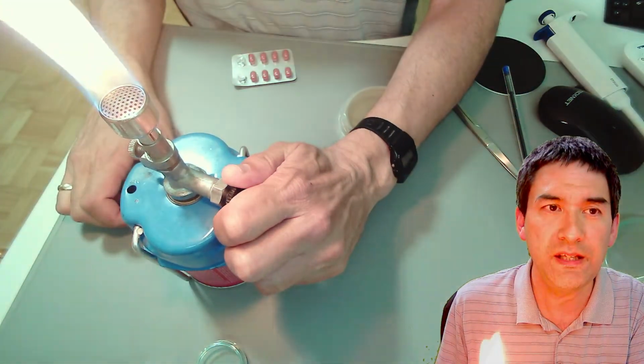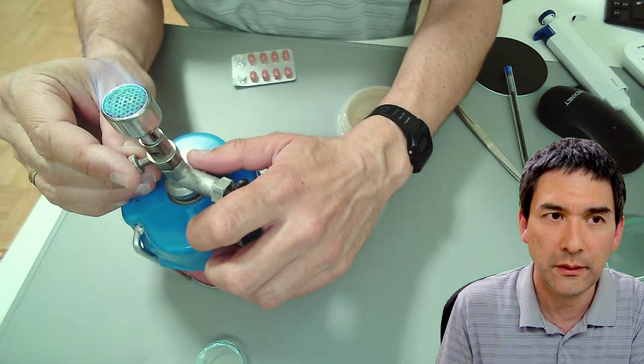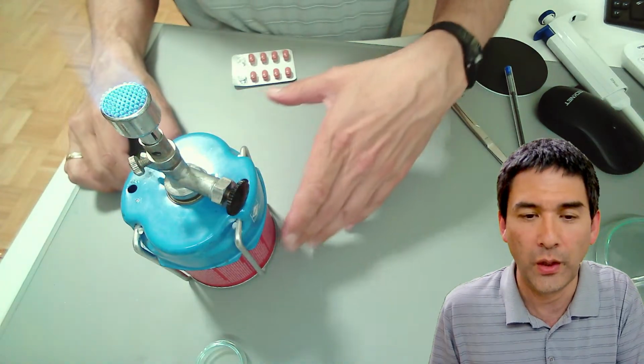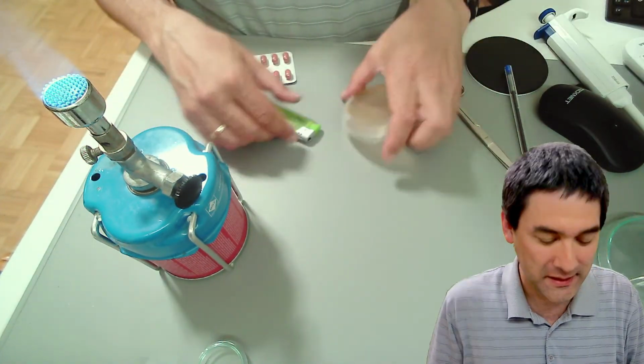I'm getting a very yellow flame, okay? And then I have to turn the air supply on, and it will switch over to a blue flame, and that's actually what I want. I have to be careful because I've got a camera over here. I don't want to burn the camera. Yeah. So this is basically the first thing.